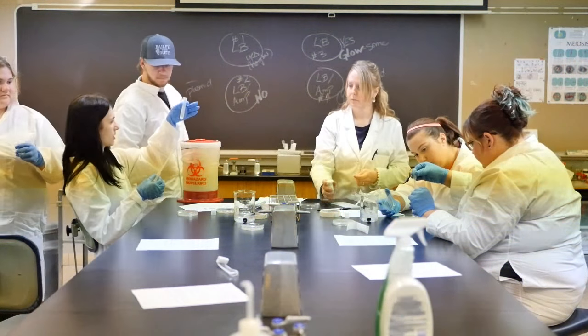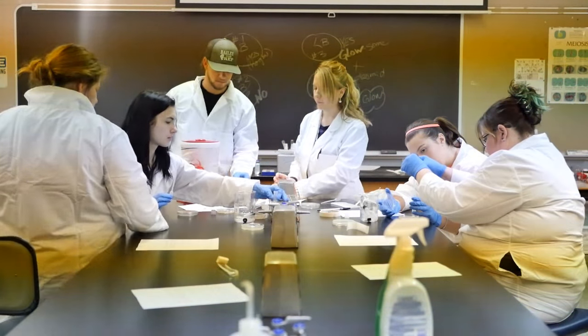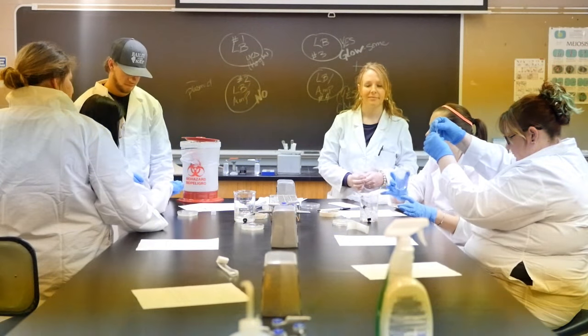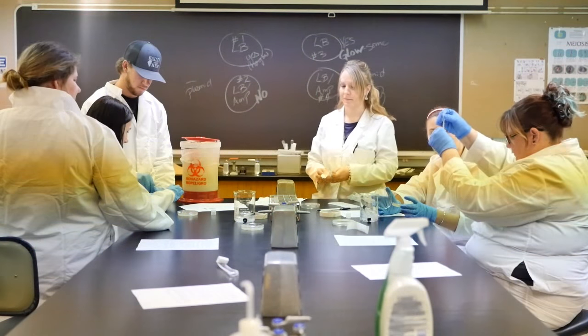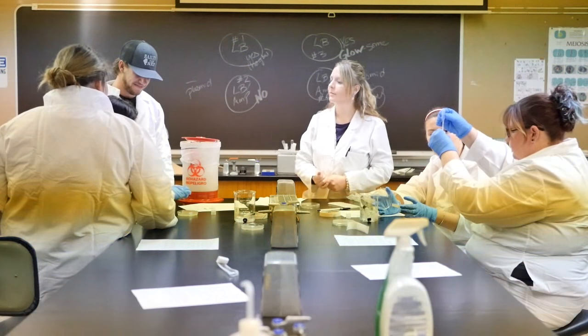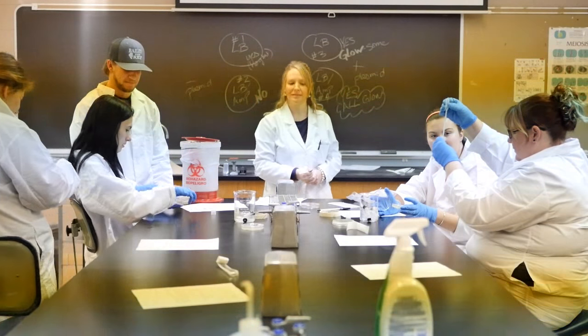There's still a little bit in there. Sure does smell interesting. Is that the gel? It's supposed to clean the gel. A few more than what we need. Keep getting too much in there. Do the thing.